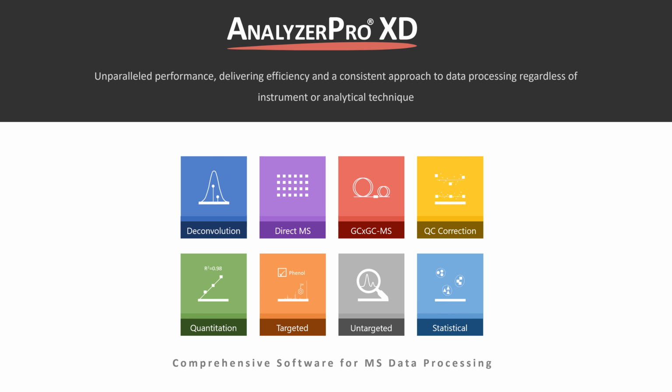With its ability to process both low and high resolution MS data from GCMS, LCMS, DART and MALDI, it is ideally suited to reduce training overheads and simplify your workflow. Regardless of the type of MS data, AnalyzerPro makes a comparison of multiple samples possible. Our approach provides statistical results that allow you to seamlessly connect back to your raw data.